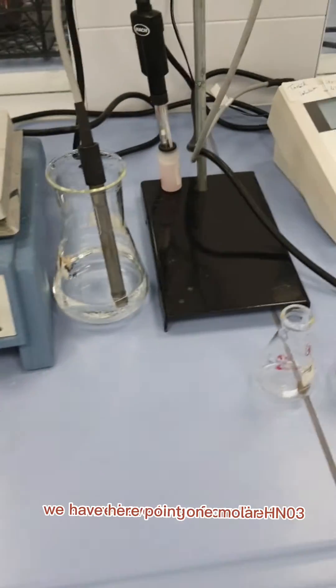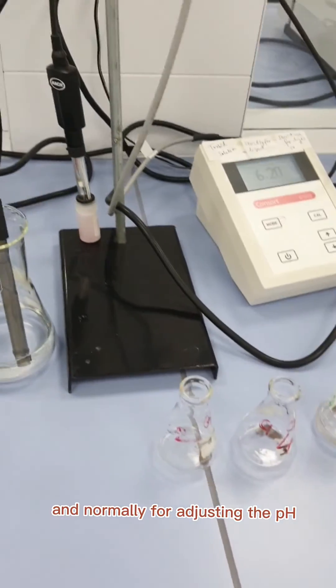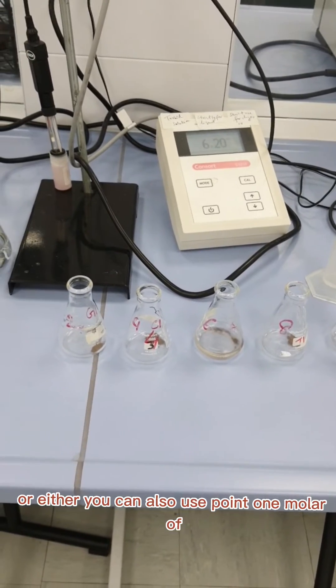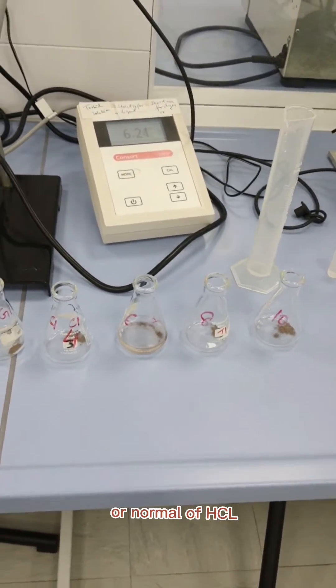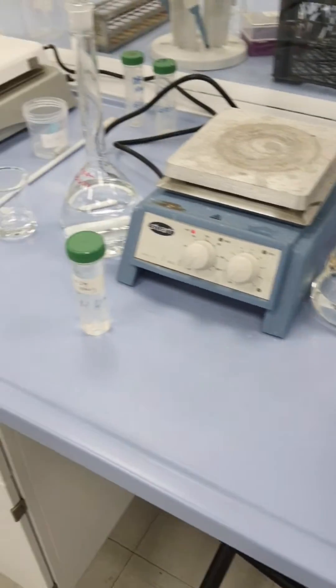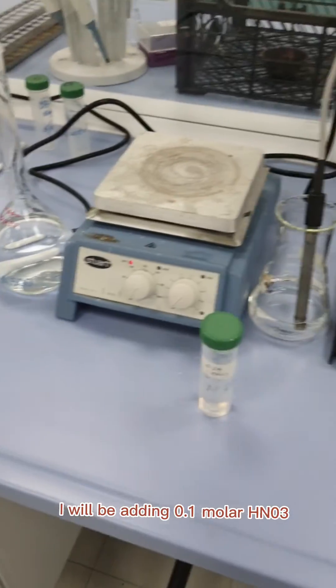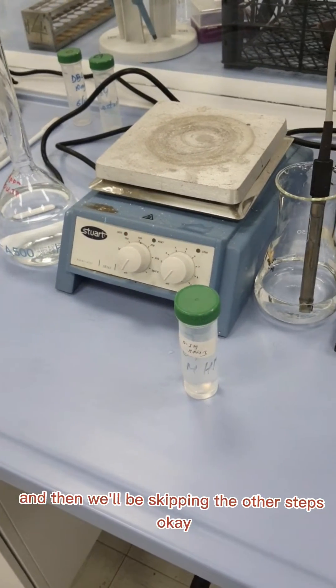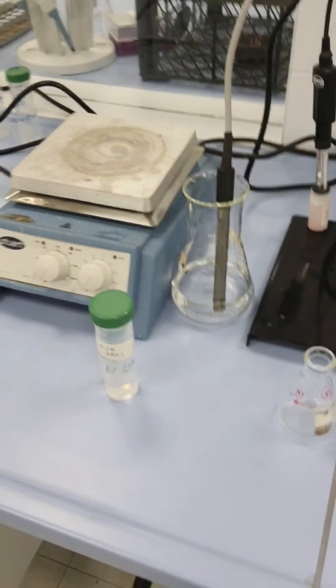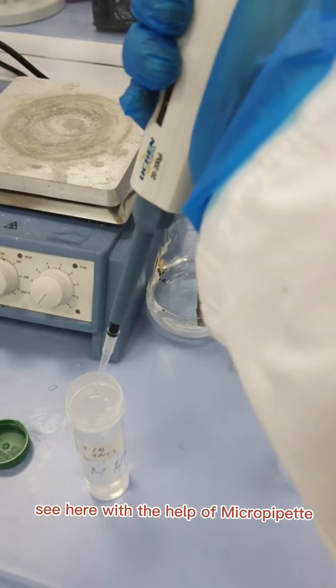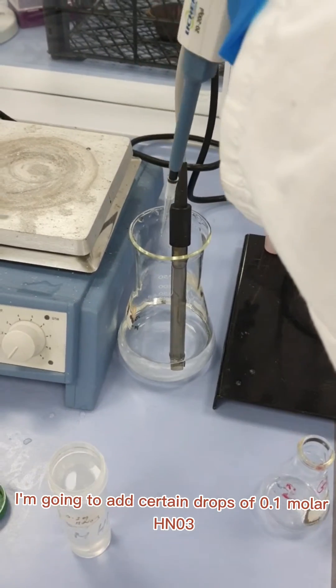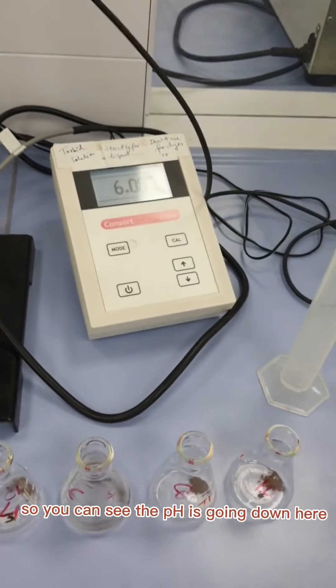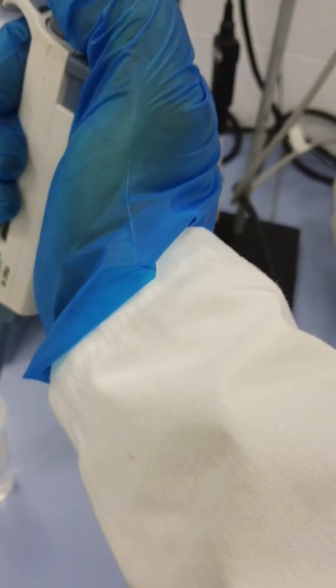Now what I will do is adjust the pH. For adjusting the pH we use 0.1 molar HNO3 or you can also use 0.1 molar NaOH. Now I am going to decrease the pH. In that case I will be adding 0.1 molar HNO3. With the help of a micropipette, I'm going to add certain drops of 0.1 molar HNO3. You can see the pH is going down here slowly.